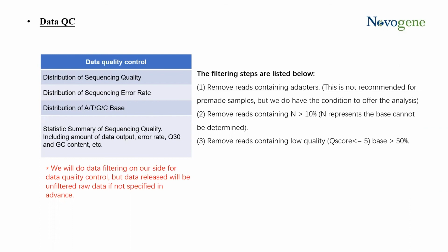We've gone over what is needed to get your sequences from a construct to the machine, from the machine to the data production, and then here, the data analysis.